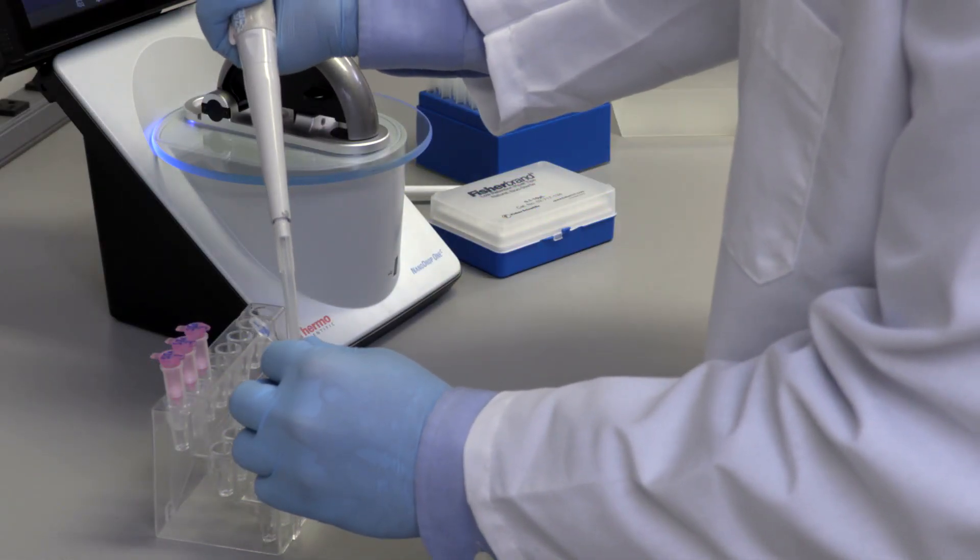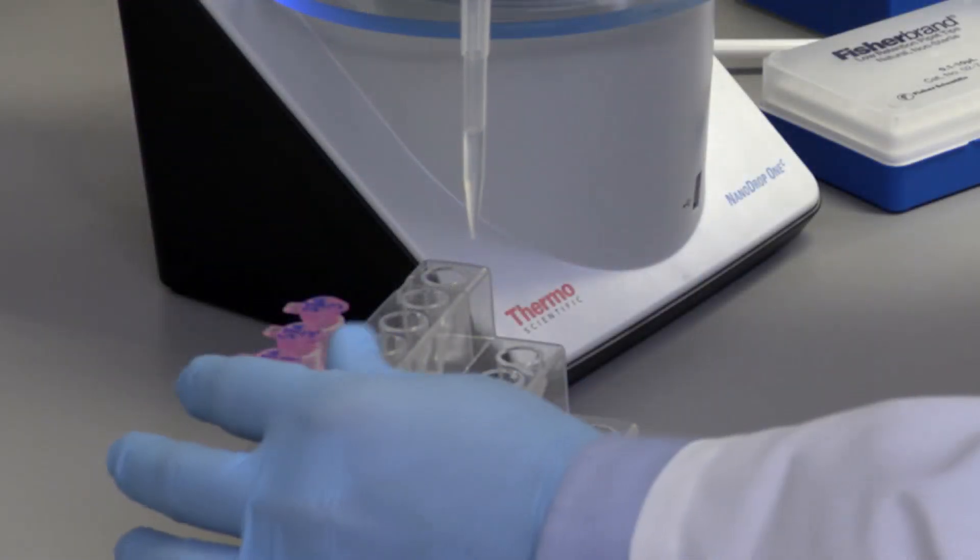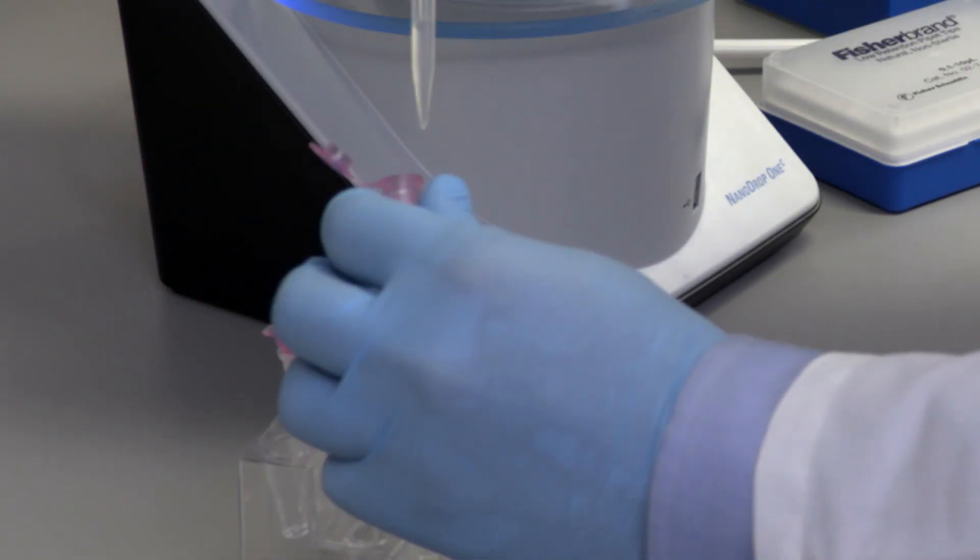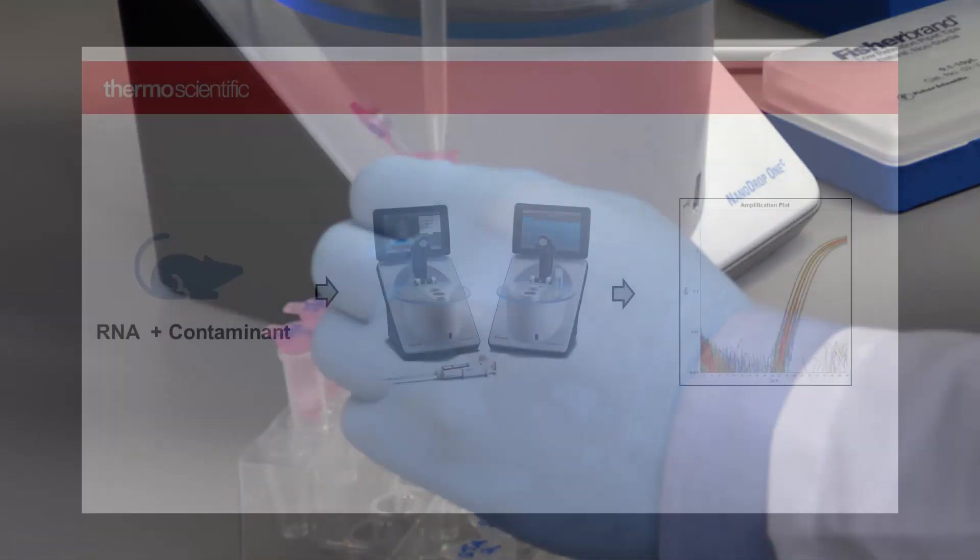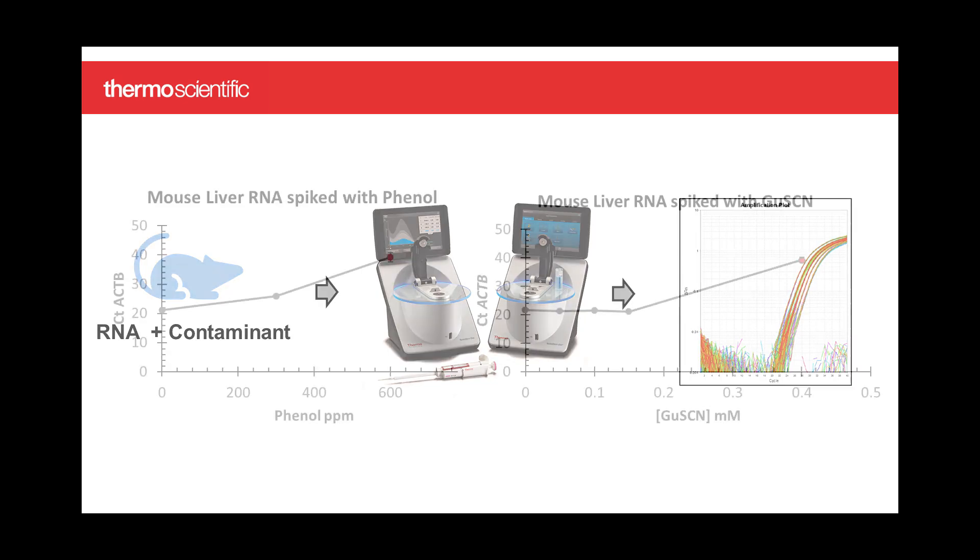Common molecules found in nucleic acid extraction kits can overestimate analyte concentrations or denature qPCR polymerases. To illustrate this, we extracted RNA from mouse liver and spiked it with a contaminant. We used absorbance to determine the analyte concentration and set up a qPCR reaction based on the uncorrected value.